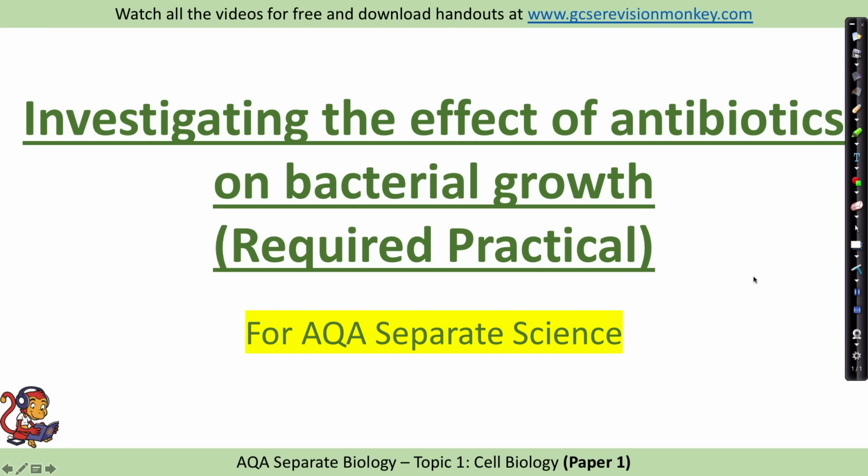This required practical is for separate sciences only, and it is investigating the effect of antibiotics on bacterial growth. Now, prior to this practical, the student or the technician might have prepared an uncontaminated culture of bacteria. That's when you use the aseptic technique, sterilising your inoculating loop and your agar plate. You're dipping that in your bacteria culture and spreading it evenly on an agar plate, storing it upside down at 25 degrees, etc.